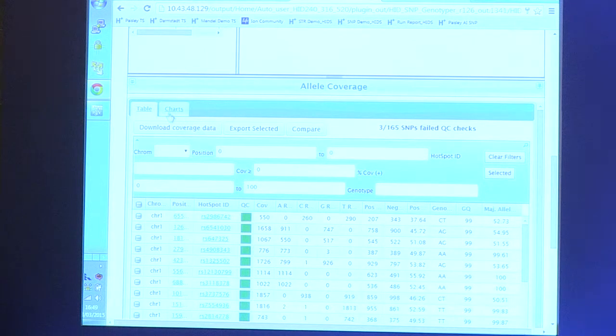Moving further down in the plugin, you start to see some more metrics that let you evaluate your profile. So up the top, it was a case of what have we done with this profile, and it showed you the SNP genotype. Here you can dive into a little bit more detail, and there's a table here that has one row for each locus in the multiplex, and as I say, it's become a little bit compressed because I'm connected to the projector, but for this first row, for example, it's telling me that the SNP in question is on chromosome 1.